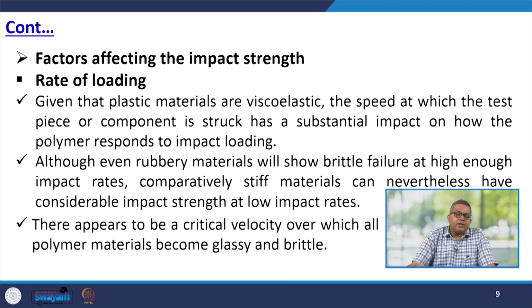There are various factors affecting the impact strength. One is the rate of loading. Now, given that plastic materials are viscoelastic, the speed at which the test piece or component is struck has a substantial impact on how the polymer responds to impact loading. Even rubbery material will show brittle failure at high enough impact rates, while comparatively stiff material can nevertheless have considerable impact strength at low impact rates.